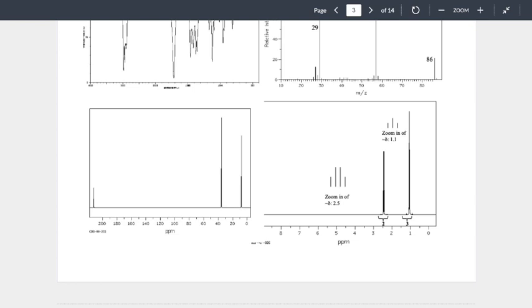That's splitting. I haven't talked about splitting. All I talked about in splitting is what's the power. That 1 and then 2 peaks would indicate the third power. I have no idea what you're talking about.